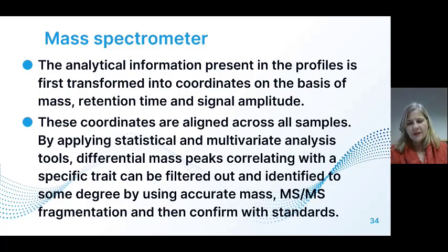A mass spectrum initially would look the same as a chromatogram. You would have your base peaks, and then you can look at each peak and get the fragmentation pattern of that peak. Initially you would get your mass, the retention time, and the idea of the concentration of your compound.